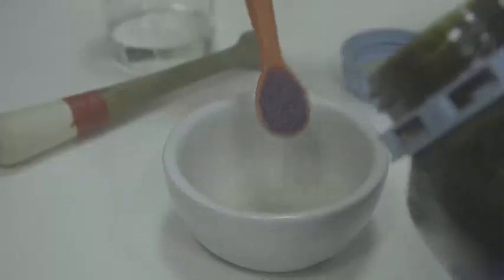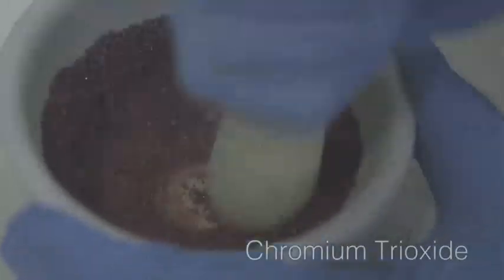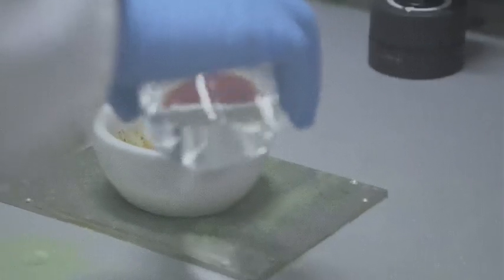Cameras have got better, and I persuaded Neil to try this reaction himself. You pour ethanol, which is a compound of carbon, hydrogen, oxygen, onto chromium trioxide, which is a compound of chromium where the chromium has given all its electrons to the oxygen. It is a very powerful oxidizing agent. It makes things burn, and it really made the ethanol burn.